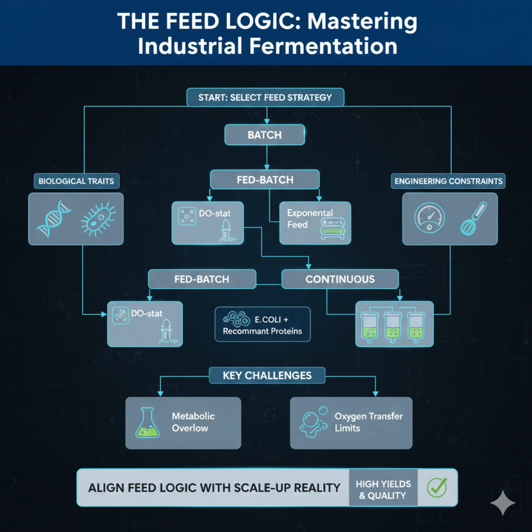So we've characterized the cell's personality. If it's temperamental, needs low sugar, and needs a ton of oxygen, we already know we're looking at some kind of high control solution. But that high control solution still has to fit inside the physical box we built. So let's pivot to step 2. Mapping the engineering constraints. What are the hard boundaries here? Right. So we're moving from metabolism to mechanical limits. The hard boundaries are defined by the hardware at the largest scale you intend to run. You have to know your absolute maximums. The primary constraints, especially in aerobic fermentation, are always oxygen transfer and cooling.